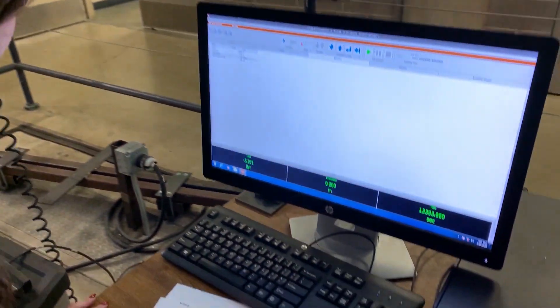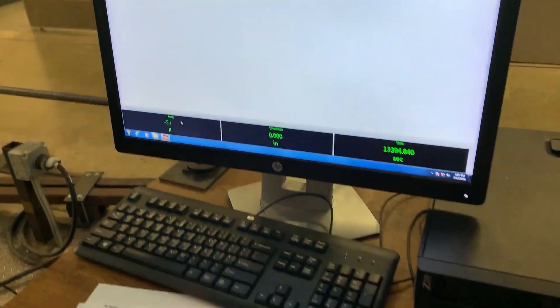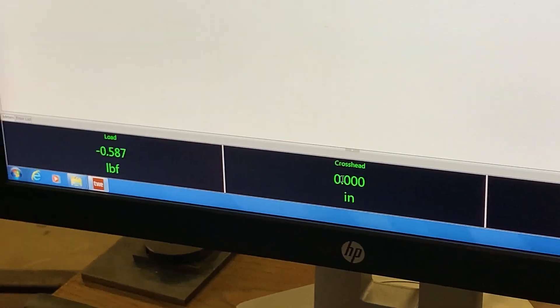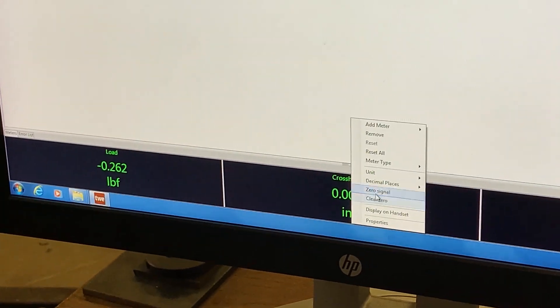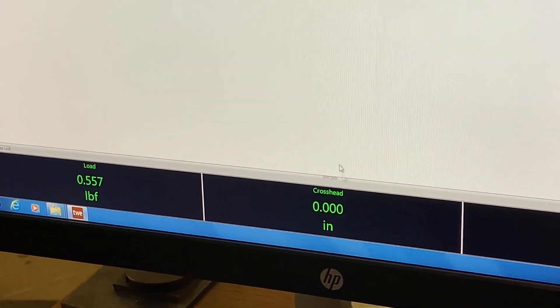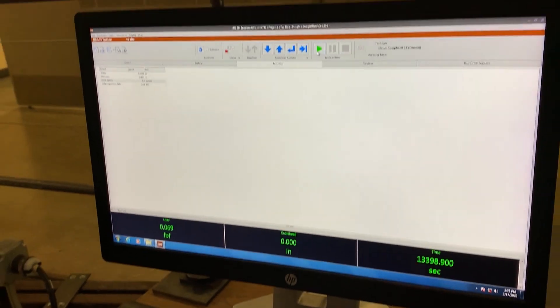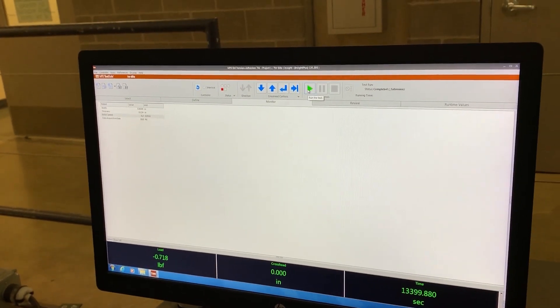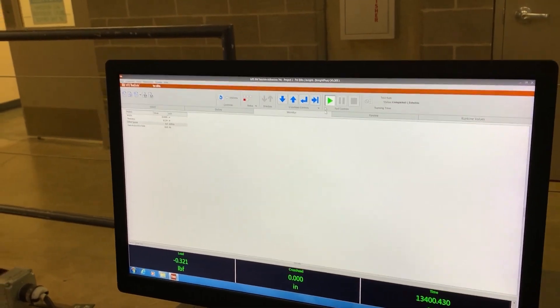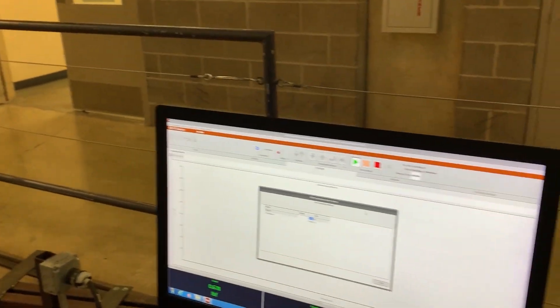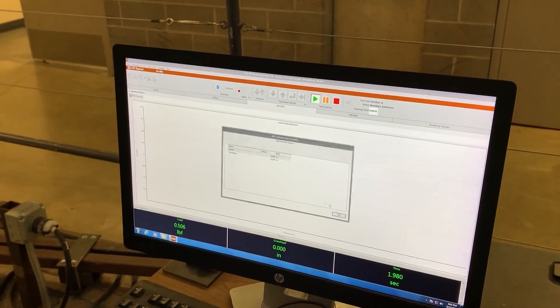Now we're going to come over here and zero out our load. It's already at zero, but we're going to zero it again, and then we're going to press play and press okay.